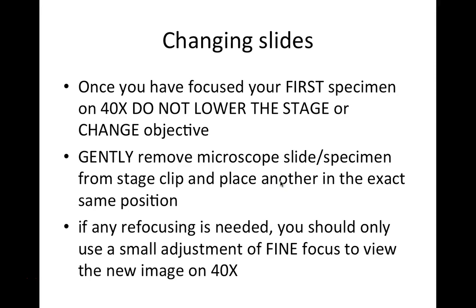When changing slides, once you have focused your first specimen at 40x, don't lower the stage. Simply leave the 40x lens in place, gently open the slide clip, and gently glide the first slide out. Place the next slide at the edge of the stage keeping the clip open, then gently glide the second slide into place and release the clip. Refocusing if needed should only require a little adjustment with the fine focus knob to see your new image with the 40x objective.